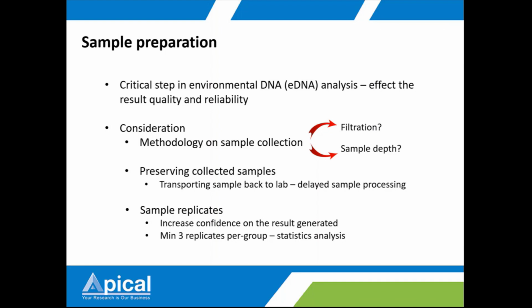This is also very important because when you're talking about eDNA, you have to go to the field to sample. Sometimes it's not a day trip return, so it might take a few days. So you might have to think about how to preserve your samples. For example, if you collect seawater, you might put it in a large tank, and then you have to preserve it in a dark room, so that you preserve not only the dark but also the temperature must be constant so that you preserve the DNA inside the sample.